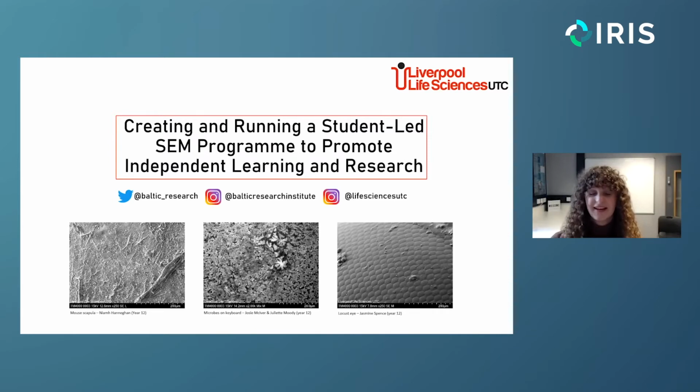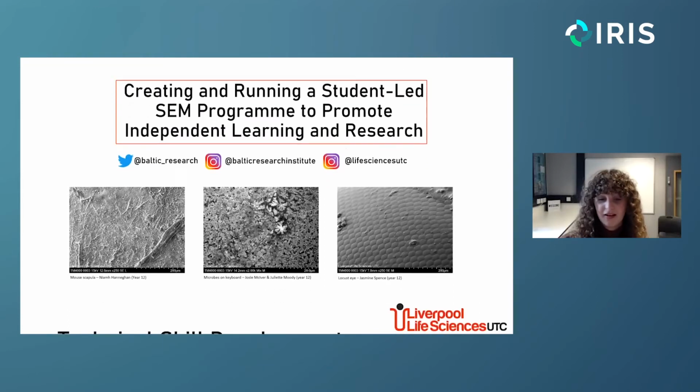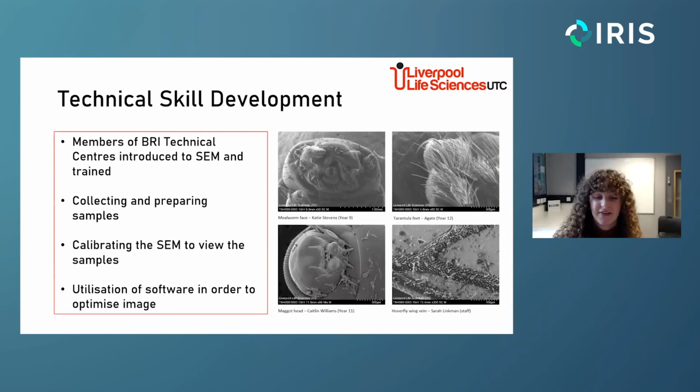Hi, I'm Jasmine Spencer. I'm part of the technical centres focusing mostly on model organisms. When we got the SEM, we were trained to use it by Miss Linkman and Dr. Dyer. This is to allow everyone to have the chance to use the SEM in the school and to see their own images. We've been able to collect quite a few unique and interesting samples, for example, the hoverfly wing shown in the pictures and a tarantula foot. We've also prepared the samples. To do this, we used carbon sticky discs and metal stubs. We also had to wear gloves while doing this to prevent contamination.